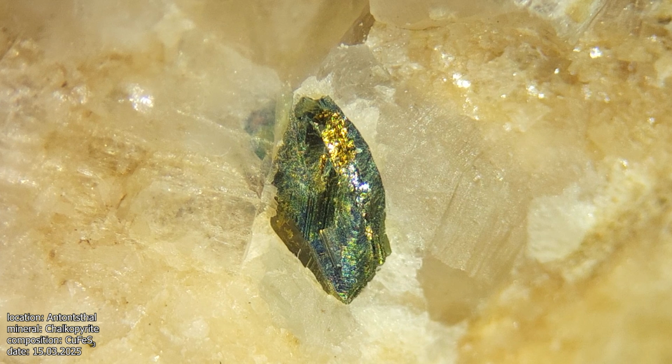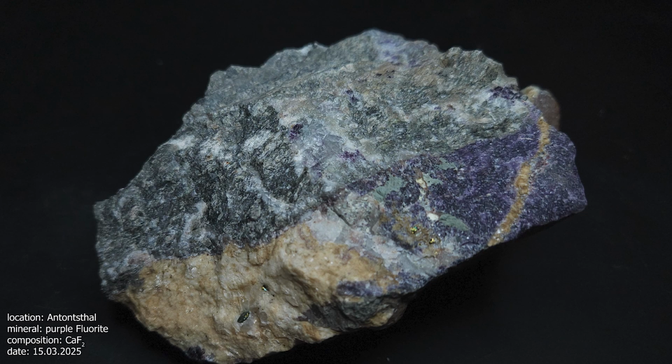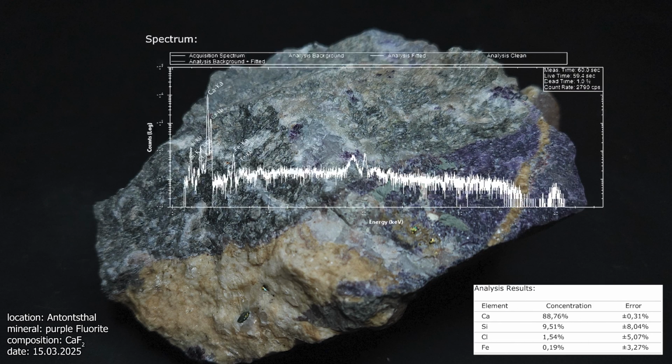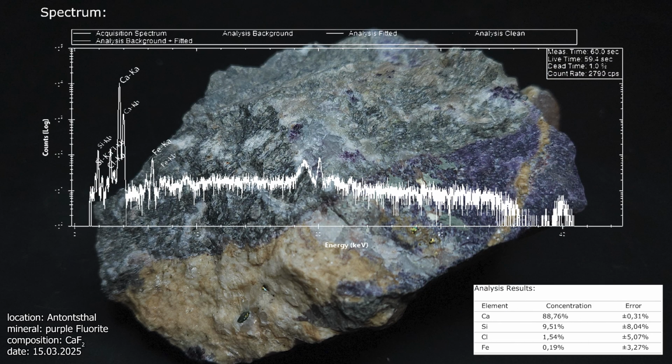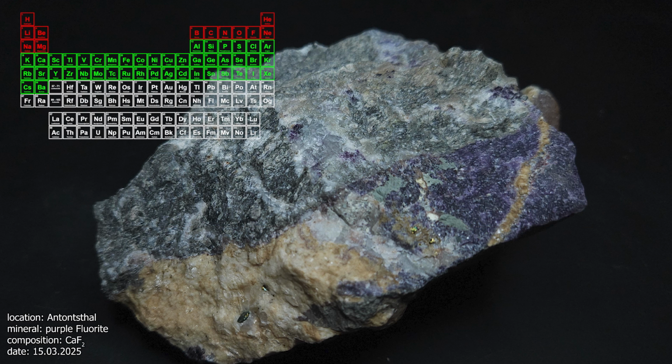Among other things, we also measured the purple part of the mineral, which only shows metals and chloride. But chloride in such small quantities, this is where things get quite tricky. Okay, under the microscope and with geological knowledge, you can deduce that this must be purple fluorite, but you can't prove it using XRF because the element fluorine, which is present here as a fluoride, is not detectable in XRF, as it's again an element of the second period. No chemical form of this element can be visible in the XRF.